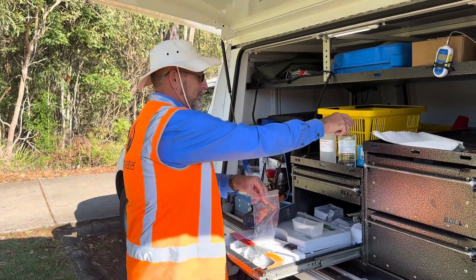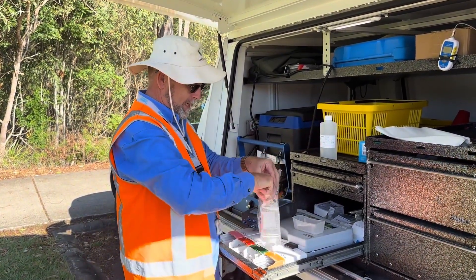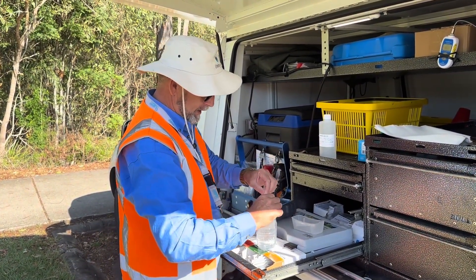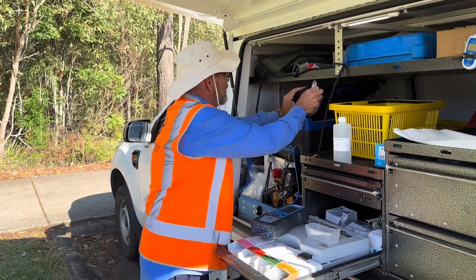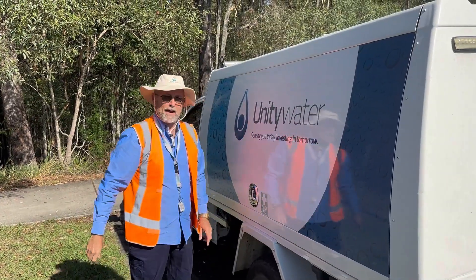Once we've taken our samples, the micro goes in the bag and both samples are then put in the fridge for chilling and transport. See you back at the lab.